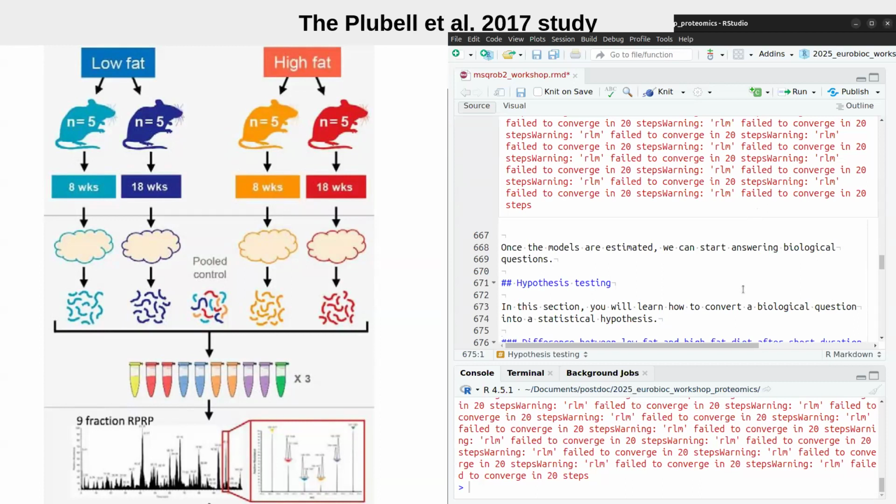I have not perfectly benchmarked it yet, but I think that's similar. What you basically have, especially in TMT data, is that it's very important to keep the information of the spectrum, because you have all the ions in the same spectrum. So having that together is useful. If you first would sum them up, you would maybe lose track of that. So therefore it's a good idea to go from PSM level data right away. That's one thing.